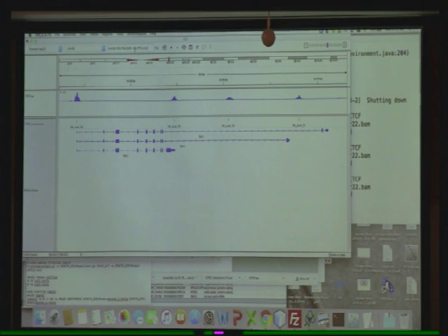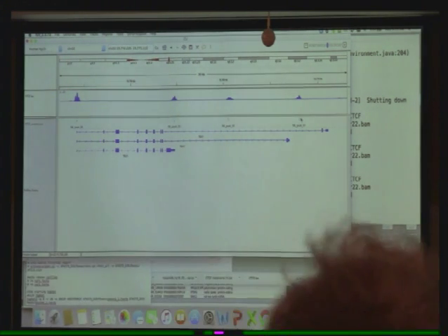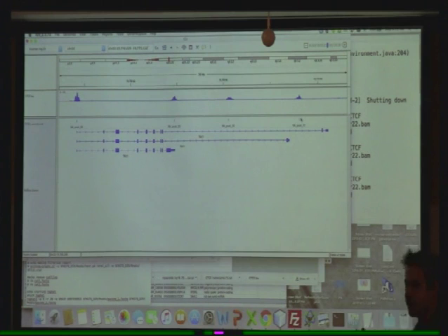Okay. So another thing that I added in here, I've loaded in that summits.bed file. That bed file told me the coordinates of every single peak of where they should be. So here you could see this is the coordinate of that one peak that was called. It's right there. This is that other peak. So it's actually correlating, yeah, it's correlating very well. Okay, so this is a great way to visualize your data.